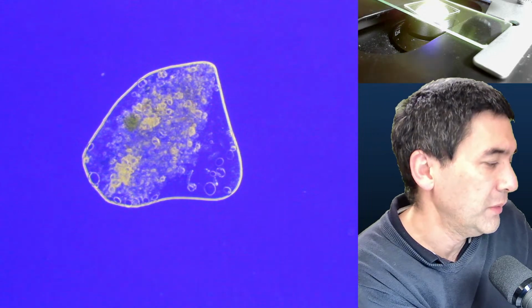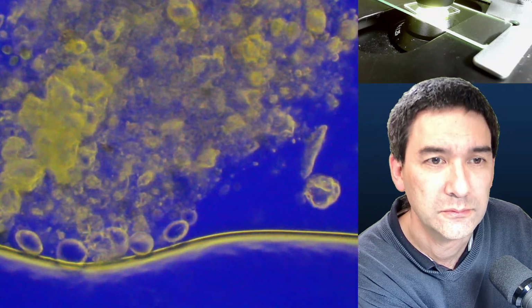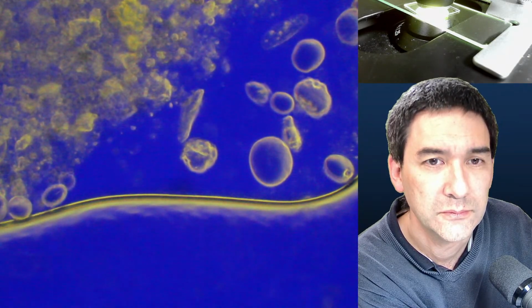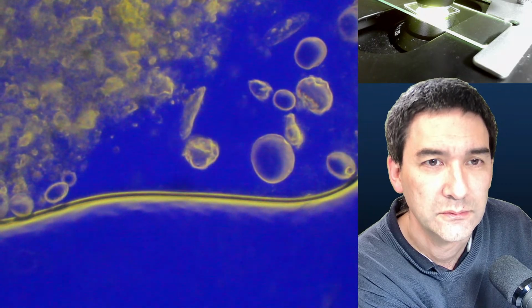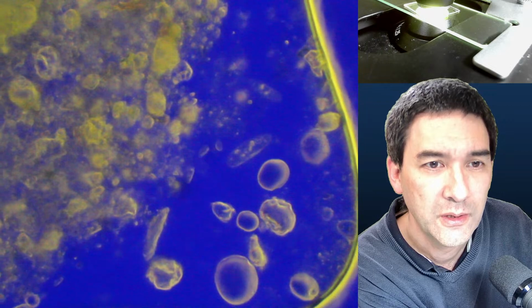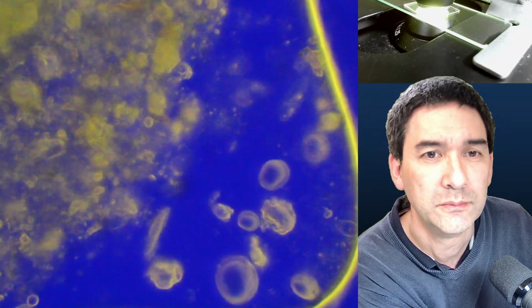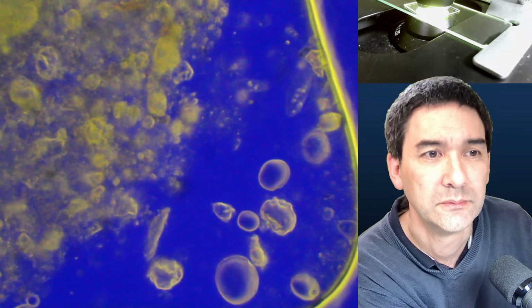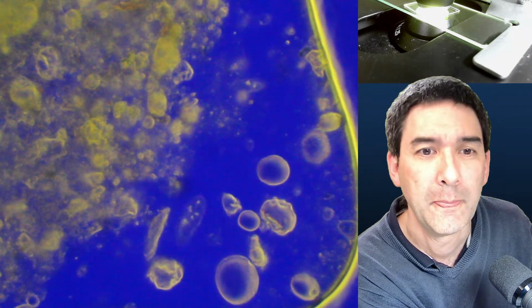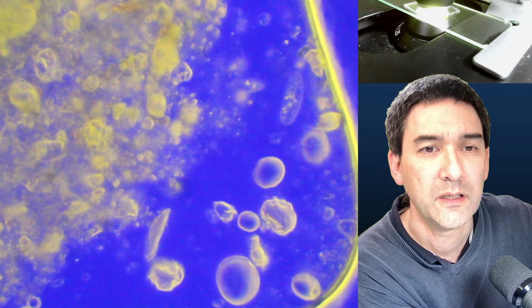Okay, let's go up here. Not good. Yeah, here we go. Now, there's a rotifer here as well. Okay, where is it here? So there are a couple of Paramecium. Maybe I'll make the exposure time a little bit longer.